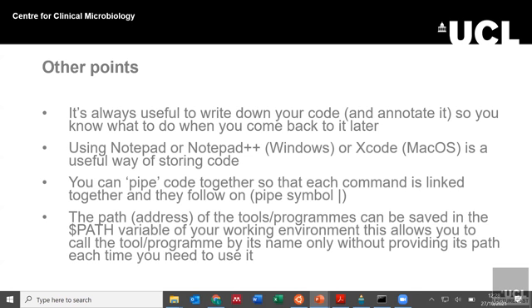So not only do I have the specific code, but I also have lines above it that start with a hashtag and that explain to me exactly what this code is for, how to use it, and what each bit means, because you might come back to different input or output. I thoroughly recommend that, because you might come back to something after 6 months and not have any idea what it is. So yeah, the more you annotate it, the better, definitely.